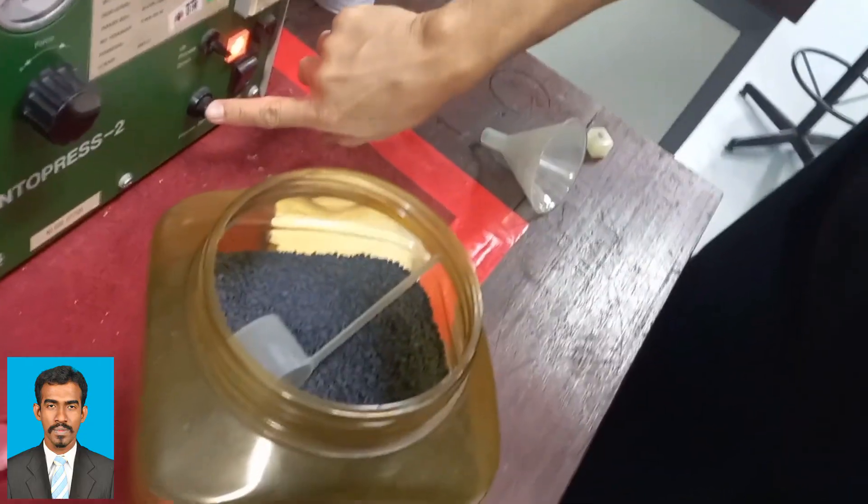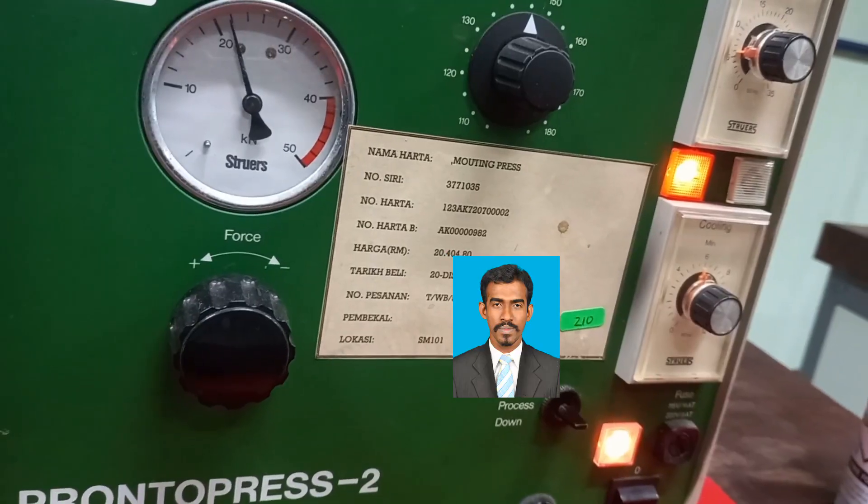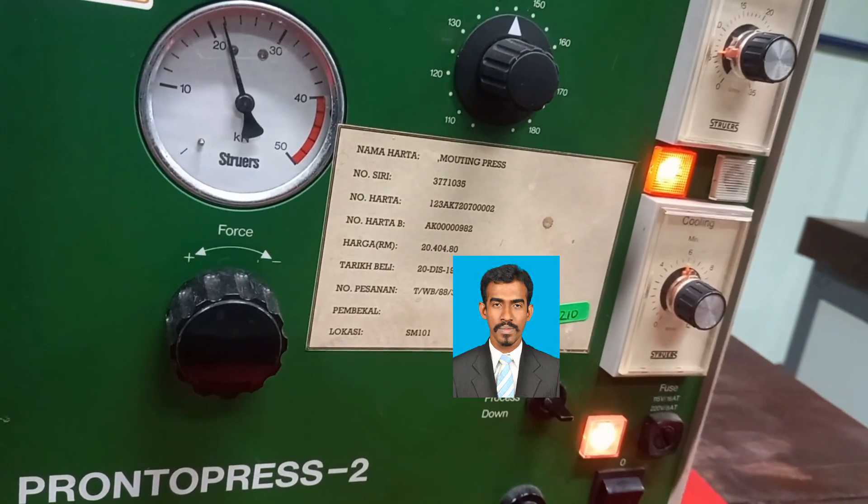Then close the mold with the mold cap and secure it. Then turn on the machine. Once the machine is on, the temperature and pressure will keep on increasing until the specified value.